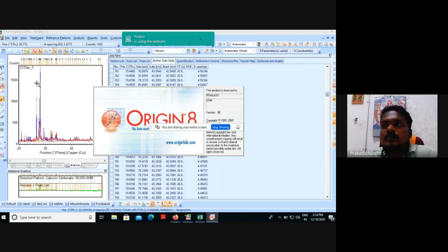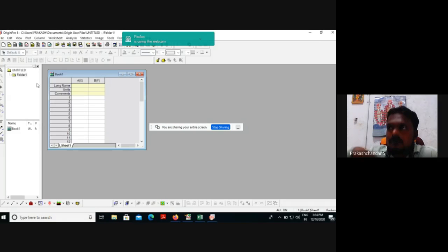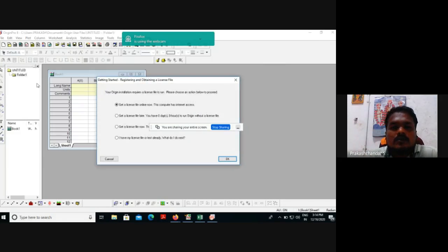This is the Origin 8 software you are using.